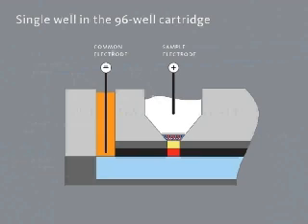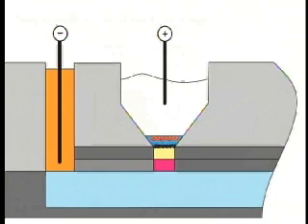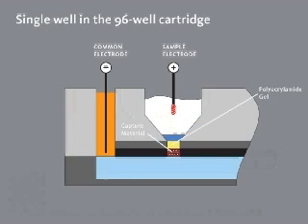In this experiment, we are capturing low molecular weight cations. The positively charged analytes in the sample solution migrate through the polyacrylamide gel layer toward the reverse phase capture layer below. Uncharged and anionic analytes remain in the sample solution. In addition to fractionation according to isoelectric point, the analytes are further fractionating according to their electrophoretic mobilities. The larger molecular weight cations remain in the polyacrylamide gel layer. The smaller molecular weight analytes are captured onto the reverse phase cartridge capture slide. The duration of the run determines the size of the analytes that get through to the cartridge capture slide. Let's go check on our run.